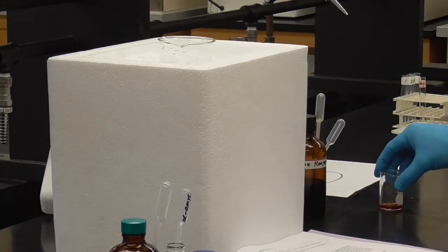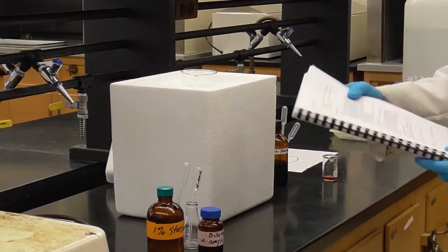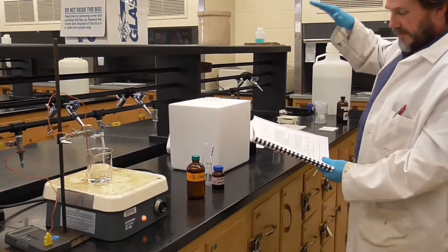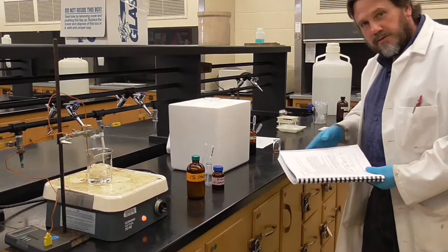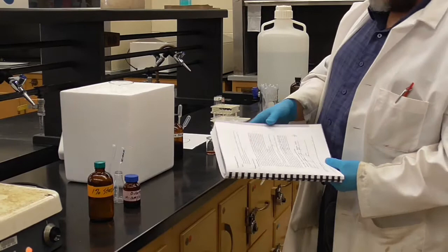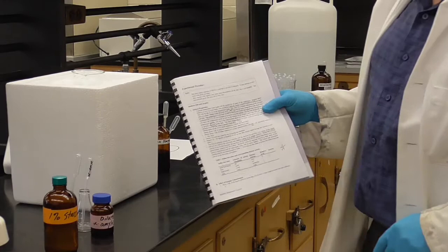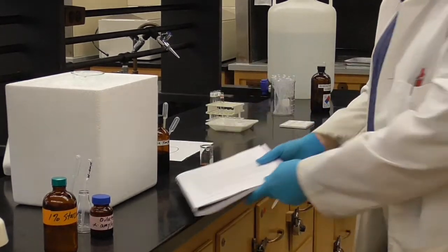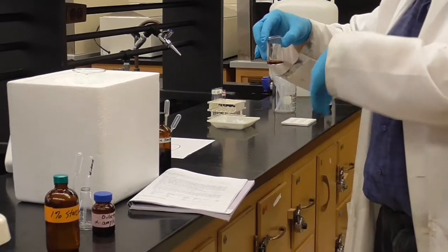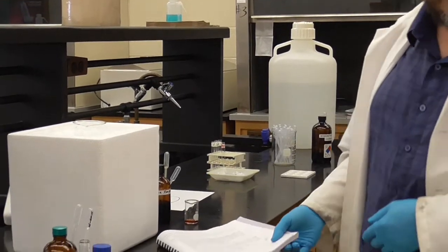Okay? And then we kind of go down in levels from there, and in the manual you have this table, and it says gold, that's the highest level of activity, number 3. A step down from that, if you got a light brown color, as it's describing, well, you had moderate activity. The enzyme wasn't working as much as before, but it was still there. Bluish color means low activity. In other words, when this indicator gets combined with some starch, it forms that complex and you start getting that blue color forming, okay? So blue color means very low activity.